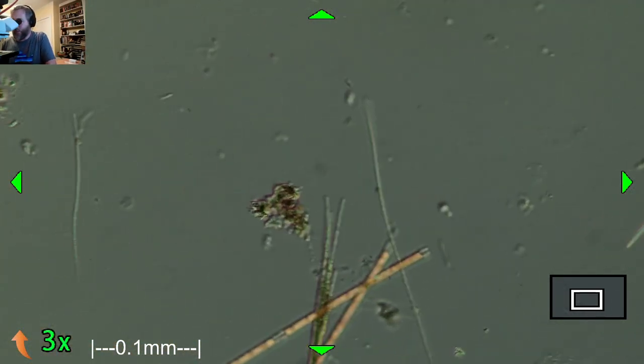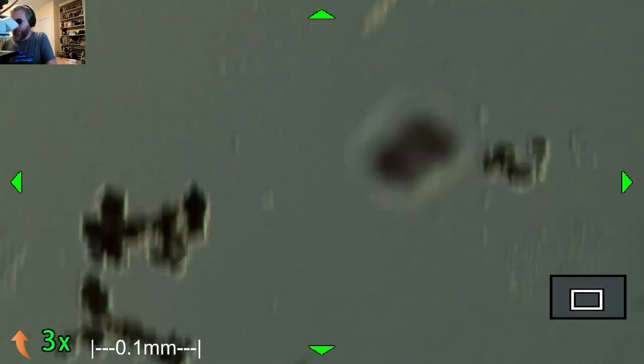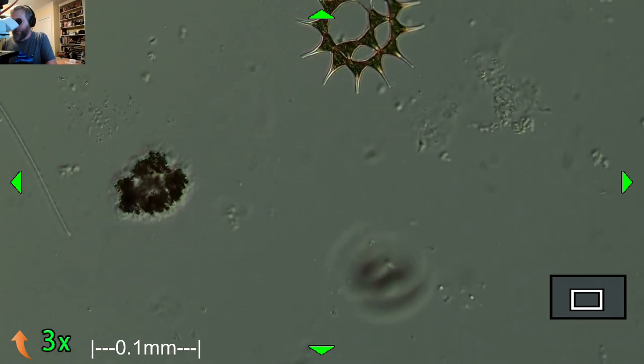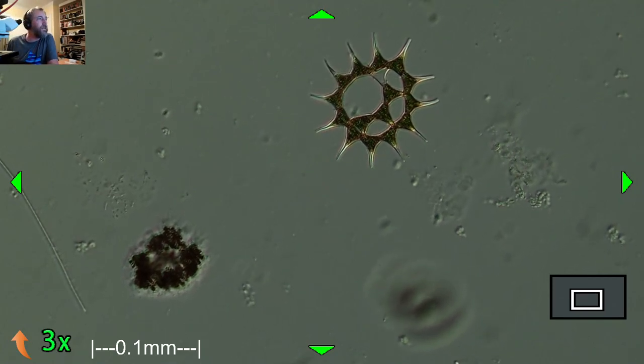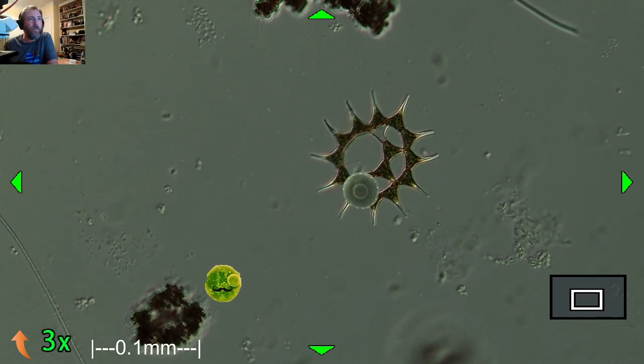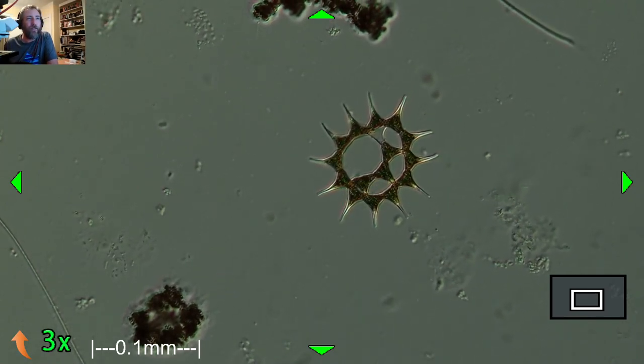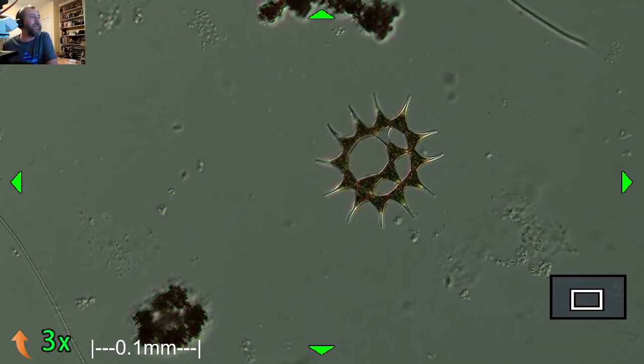That's a Pediastrum. One of many Pediastrums. I don't think Oscillatoria is on there though. It's not a diatom. So it should work for you, but it should only work with diatoms. The links won't work, they won't lead to anything.